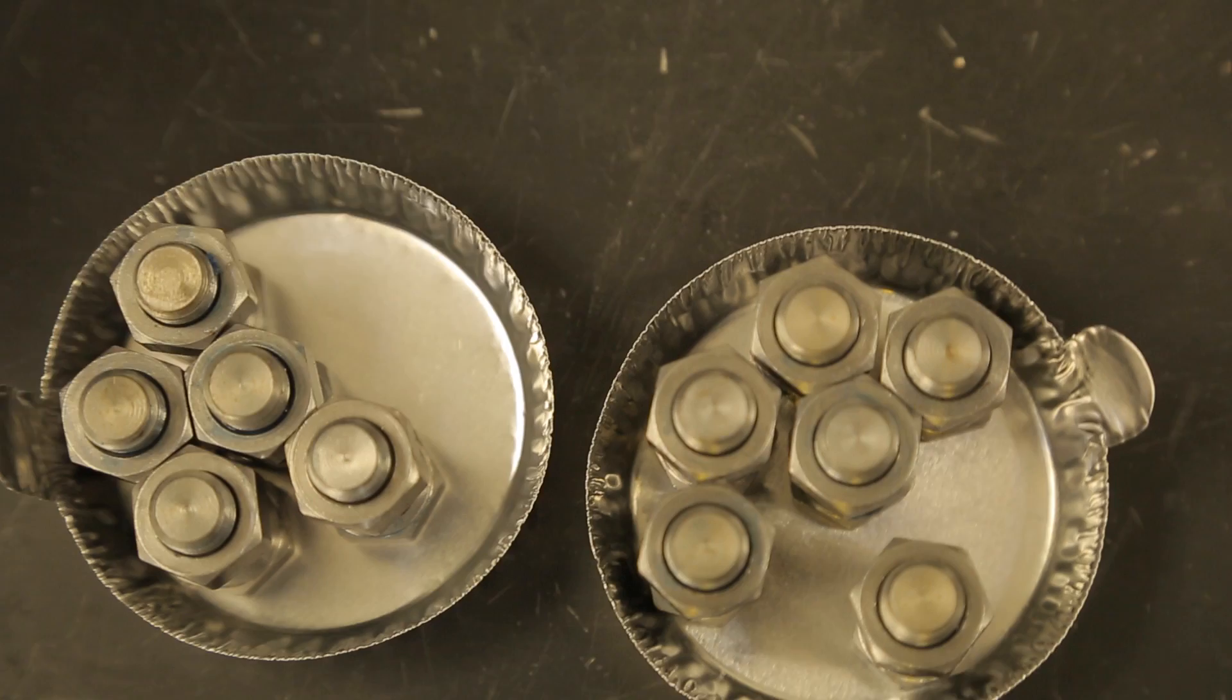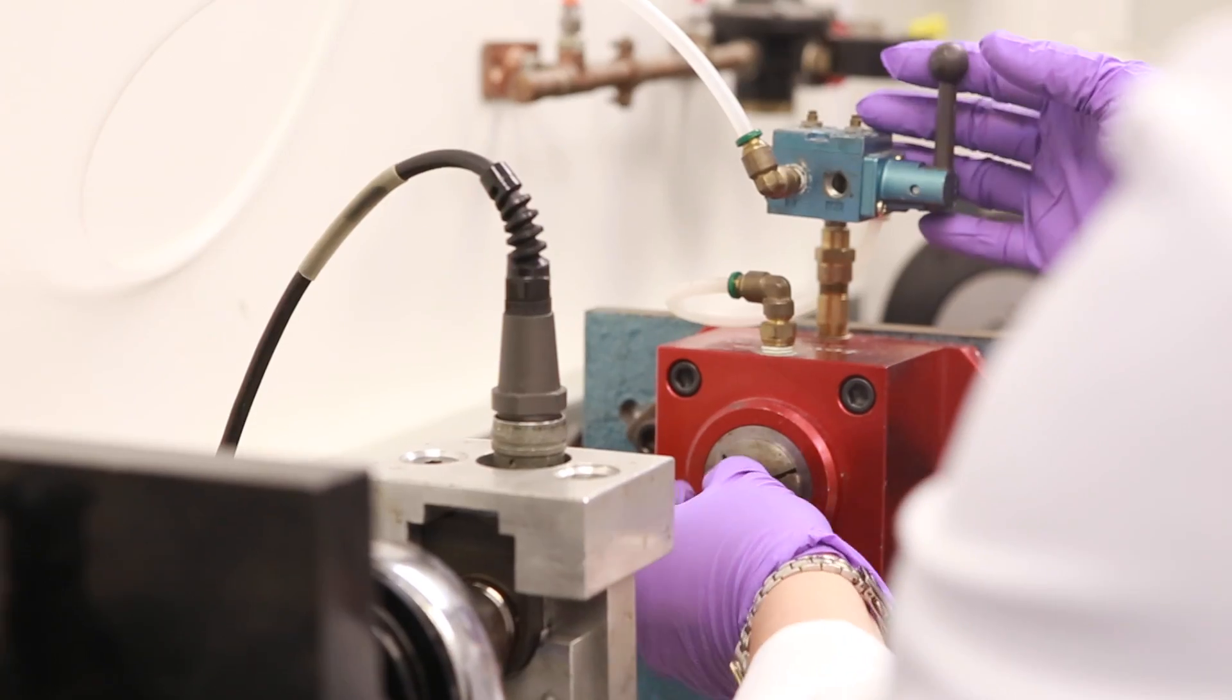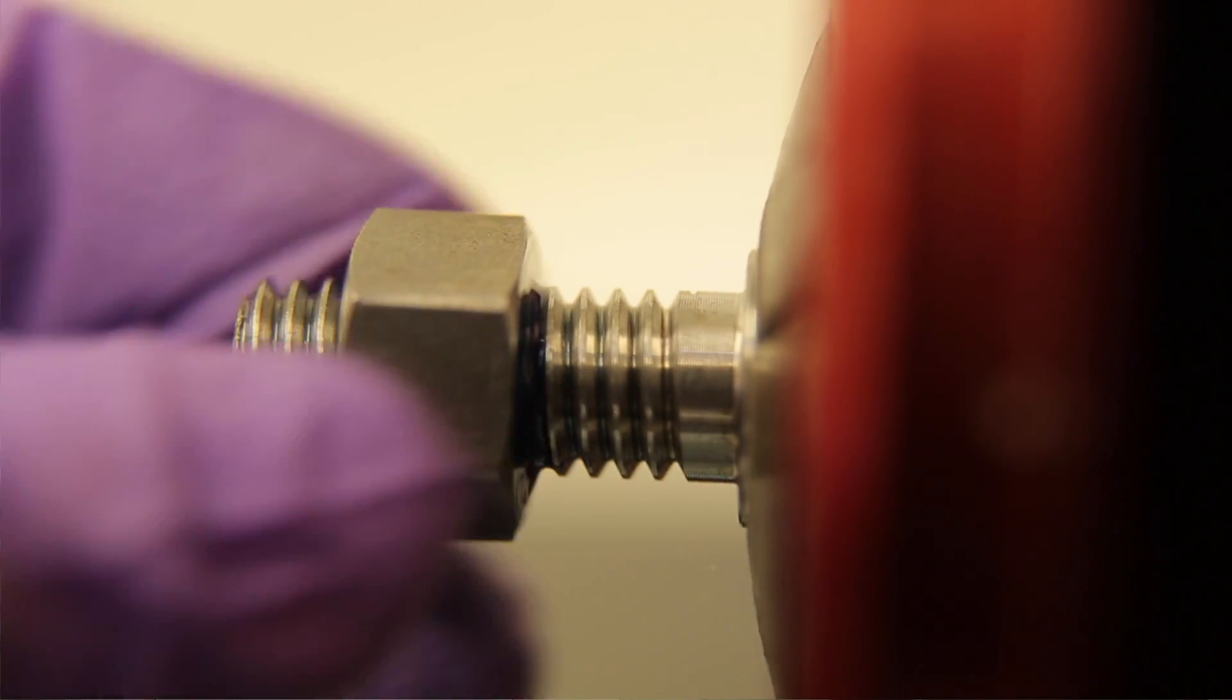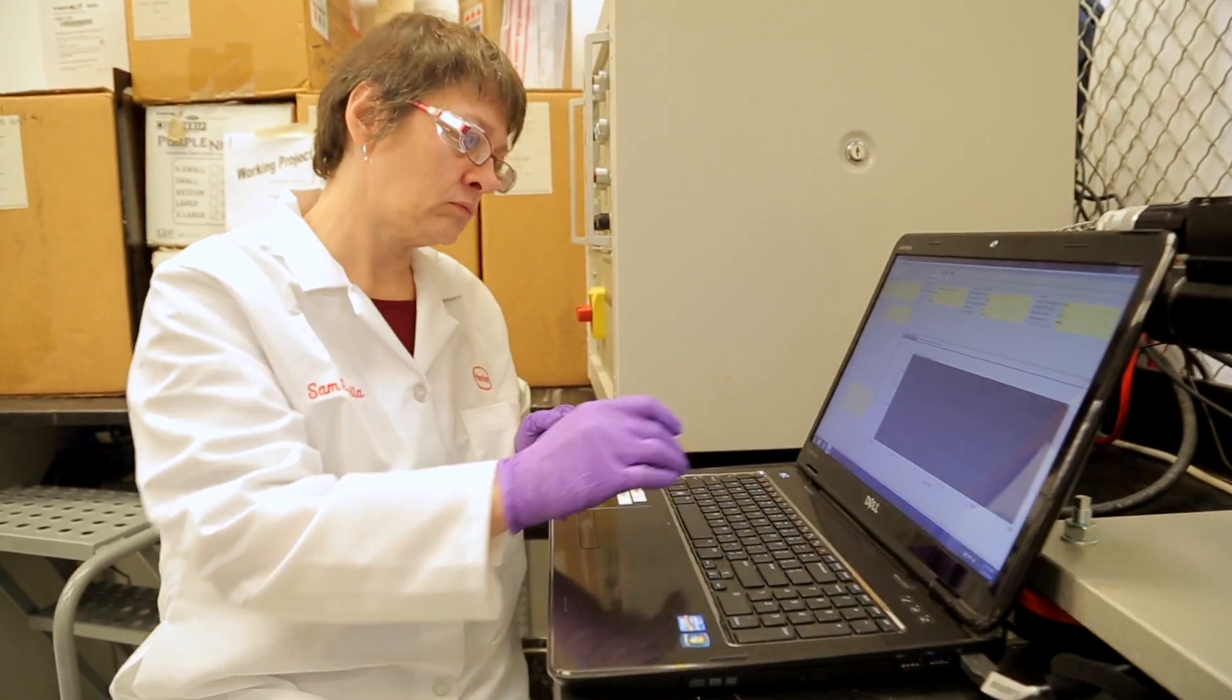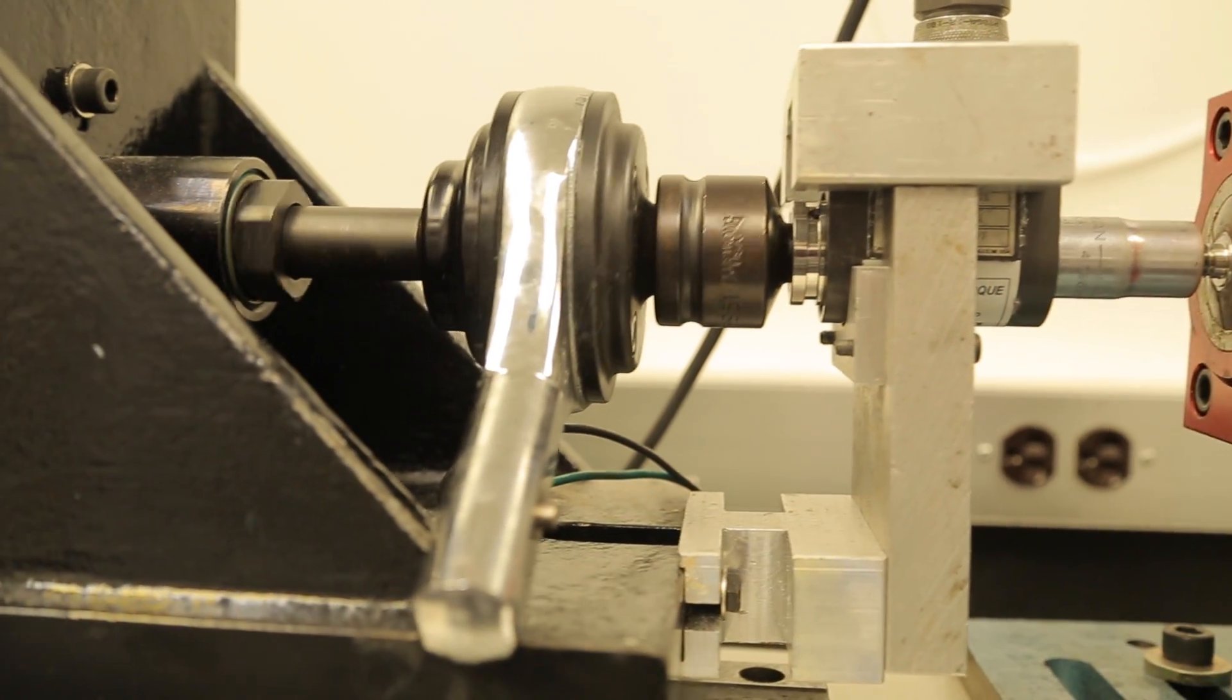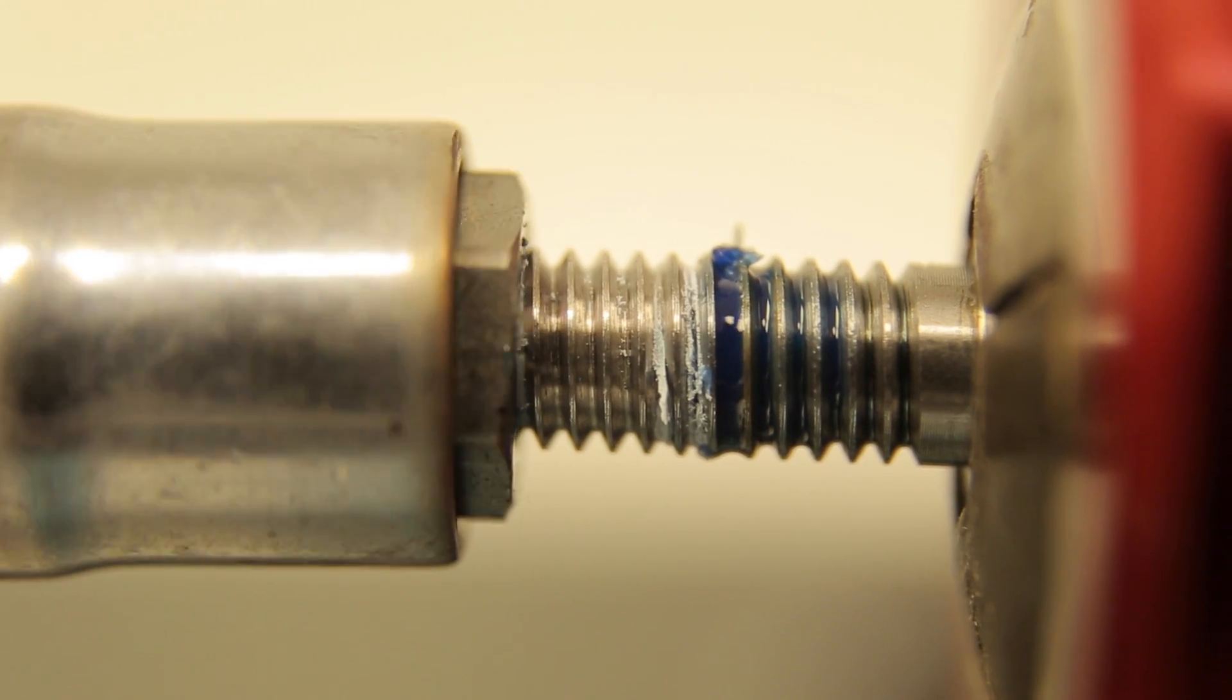One way we test these adhesives is by using straight threaded fasteners like nuts and bolts. A bonded assembly is seated in the torque tester and tested at a defined rotational speed. The initial result recorded is the strength of the first break in the cured adhesive. This is the breakaway value.